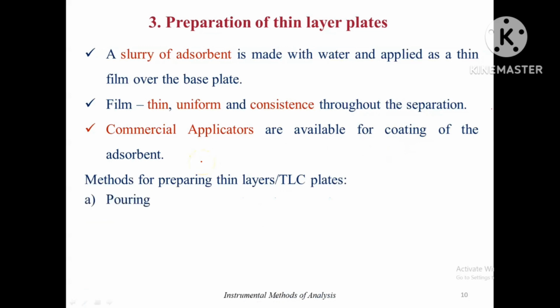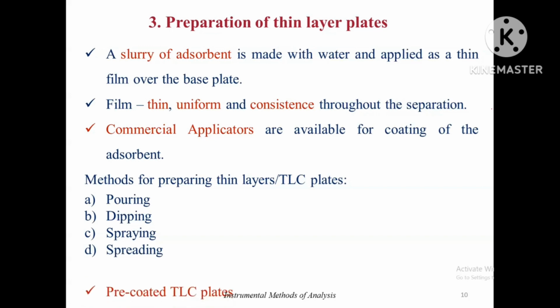TLC plates can be manually prepared by any of the following methods: pouring, dipping, spraying and spreading. These are the 4 methods by which we can prepare TLC plates manually. Alternatively, pre-coated TLC plates are also available.